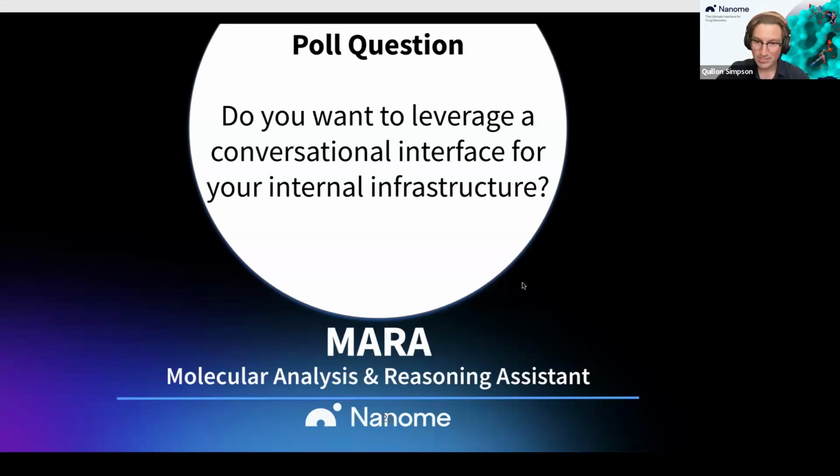We've got a great question here, Edgardo, from Jenna Darden. What is the validity of generated information through Mara? That's a great question. I'm guessing that your query here is related to the hallucination issues that you face with large language models. We avoid that by not using the large language model itself as the origin of your knowledge base. We simply use large language models as reasoning agents in different ways throughout the Mara ecosystem. So we avoid the issue of hallucinations in the platform.